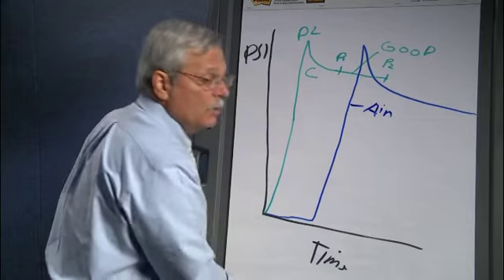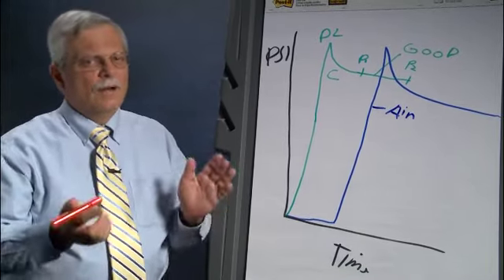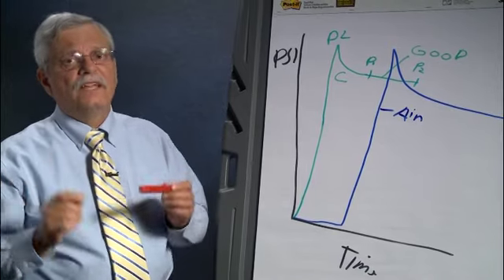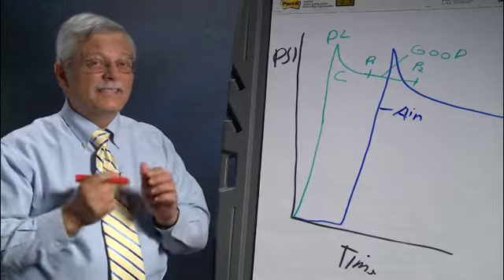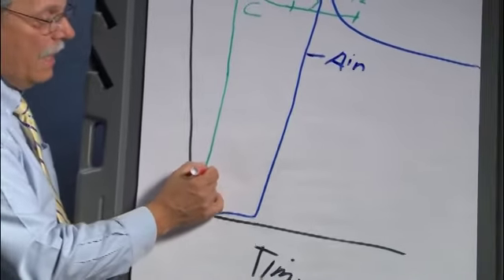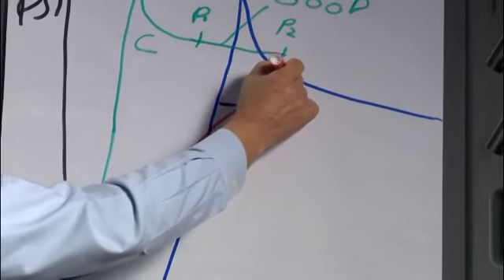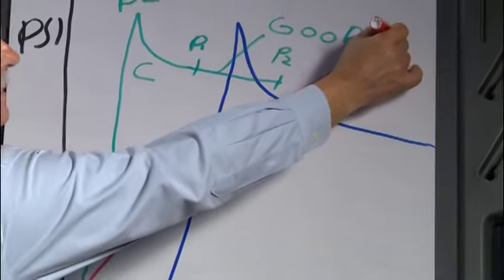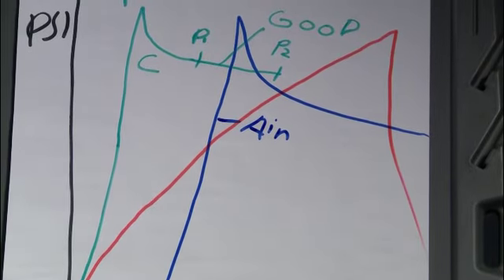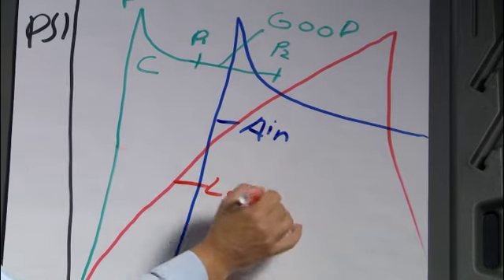Another thing that could happen is we could have a leak. Again, a large leak, we're not going to see any change in the pressure. But if there's a small leak, like the syringe really isn't tight enough, or maybe a fitting inside the machine on the sample loop isn't quite tight enough. As the pressure will rise up in the beginning, as you go higher and higher in pressure, the apparent leak looks worse and worse, until if it does hit the pressure limit, the pressure drops off very quickly. So this would be a leak.